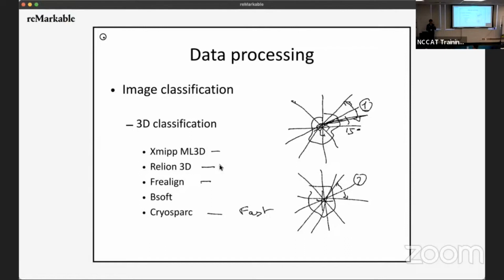And at some point, things would get constrained, but I don't care, because in the first round, it would be very coarse differences. And usually, I would sort out the junk from the real stuff that way, having identical references to start with, but starting at very low resolution and funneling down as slowly as possible.